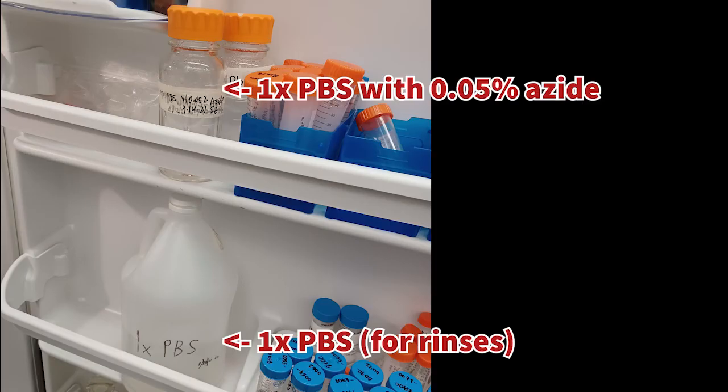Lastly, be sure to return the 1xPBS jug and the 1xPBS with 0.05% azide bottle, both back to the fridge door locations as shown here.